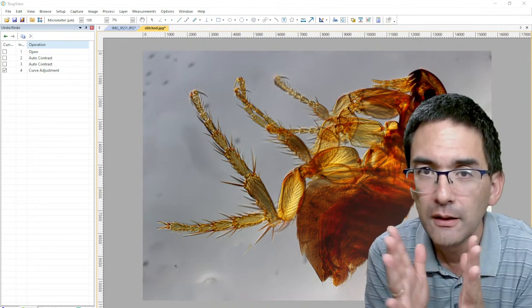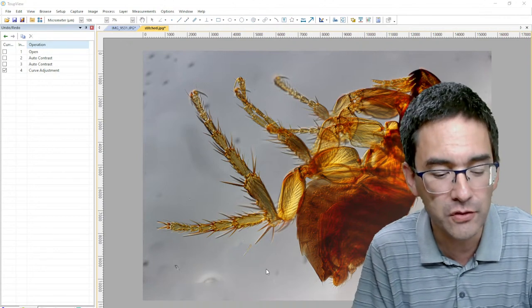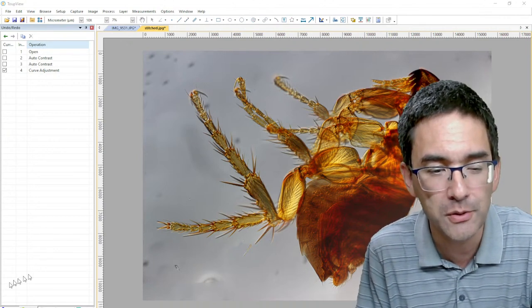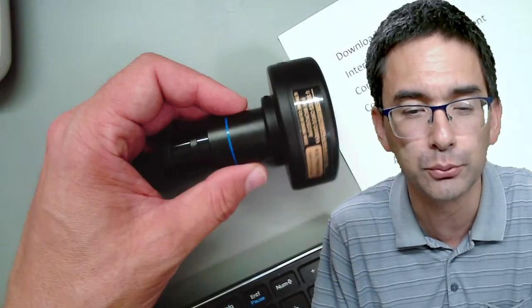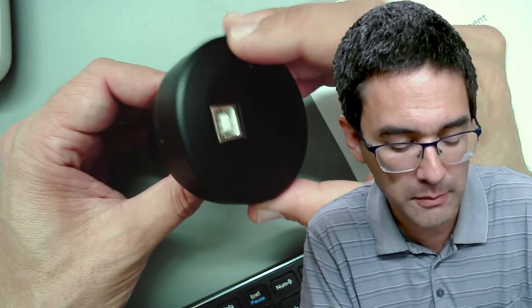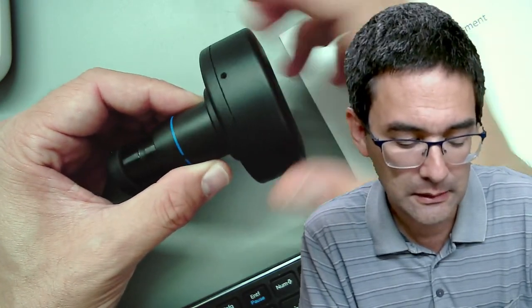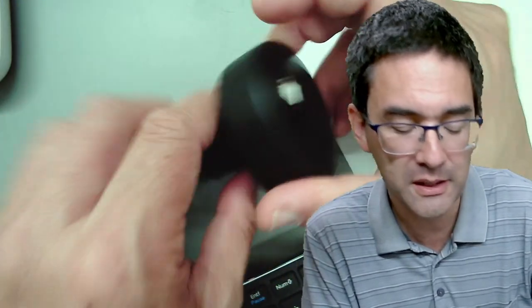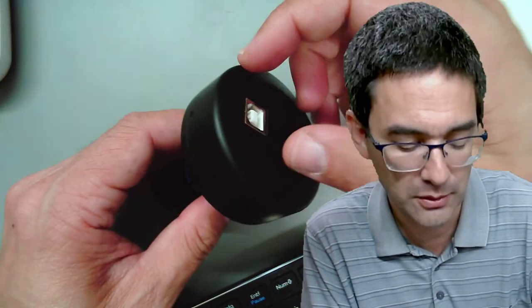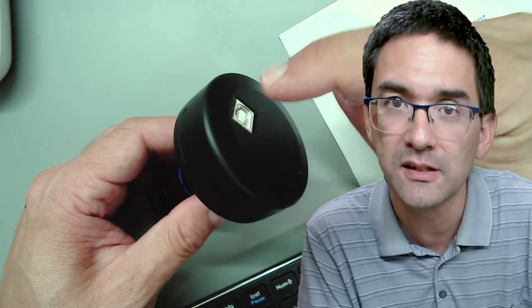Number one, generally those microscope cameras, I'm going to switch over now to the desk view so that you see one of those microscope cameras, because they have a general problem. Okay. Those guys here. Okay. That's a slightly older model, 3 megapixels, doesn't matter. It's USB 2.0. And there is a reduction optics and it's connected directly to the computer. The problem is that the USB 2.0 is generally quite slow.